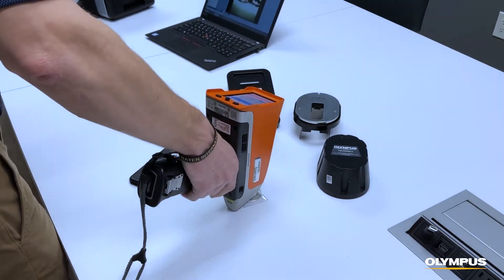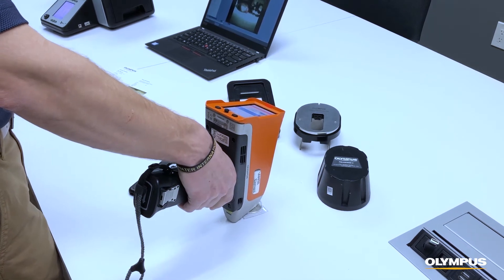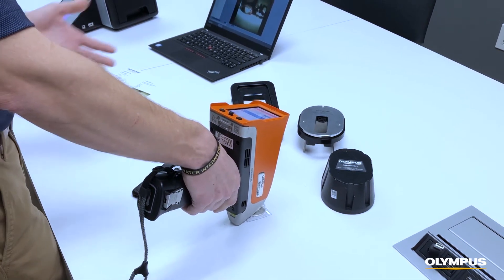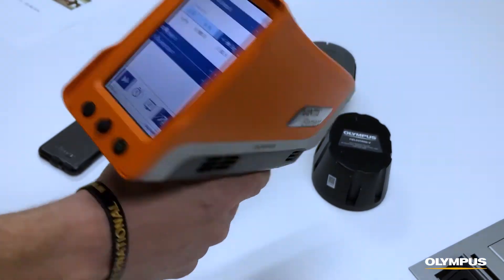This works well for large samples such as gold bars, silver platters — items that are too large to fit inside of the Gold Expert. Simply place it down on your sample, point and shoot, and take your results.